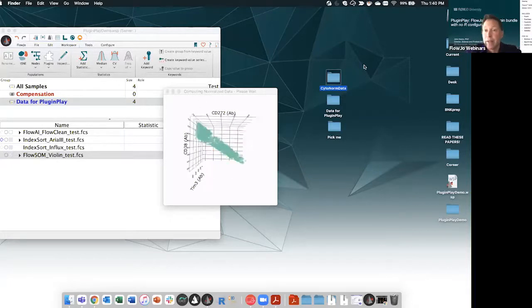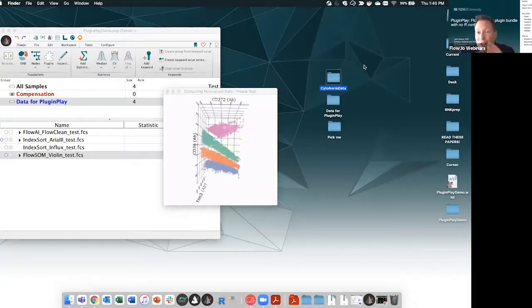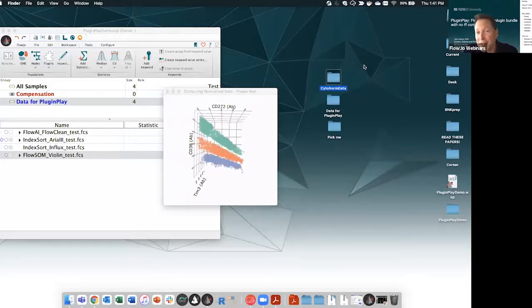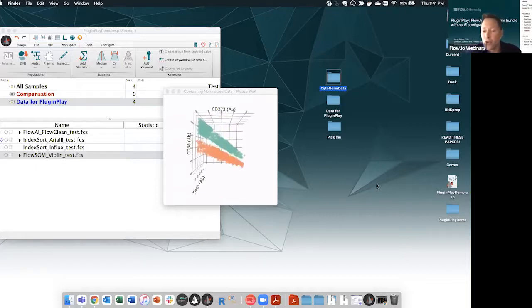We are caught up. Okay, that's about what I have to show you today. With, again, the main thrust of this having been achieved, whatever, half an hour ago, that this is now much easier to use. So I think you can tell how excited I am that we've got this new tool available, because I think some of these plugins are really powerful, and they're just great ways for us to connect people with really great science that's been done by a number of different people. So fingers crossed this makes all plugin use, at least these, what, 3, 4, 5, 6 plugins, much easier right away, and is the future path for ease of plugin use. Any other questions?